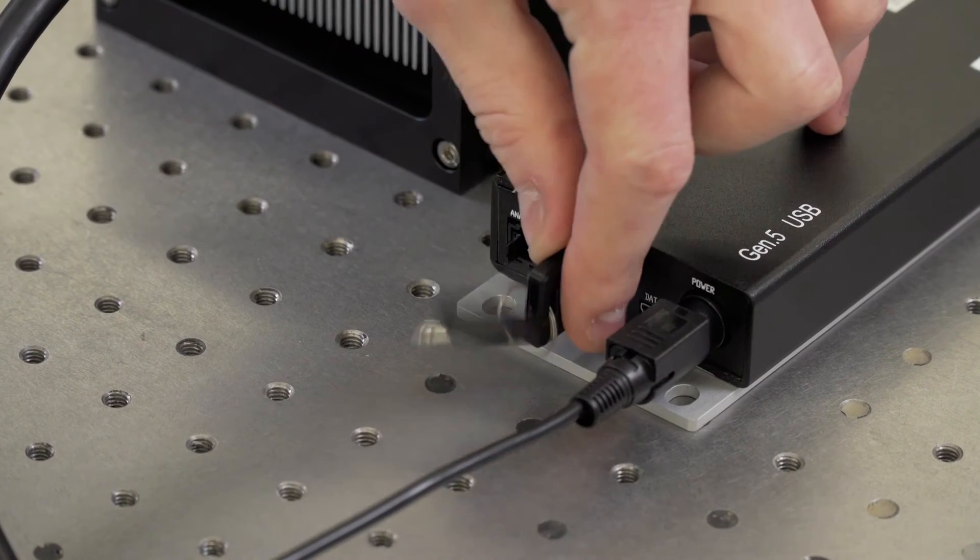If you have a CE marked CDRH standalone laser intended for lab use, then there will be a key included, which you may use to turn the laser on and off.